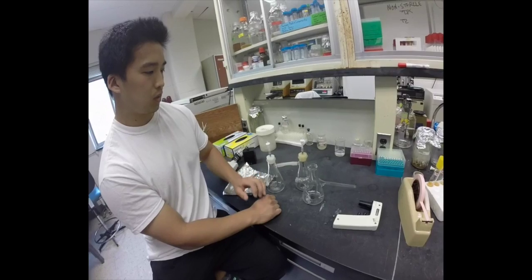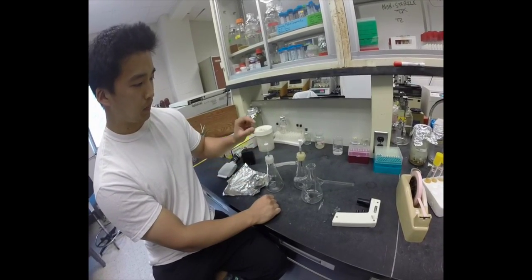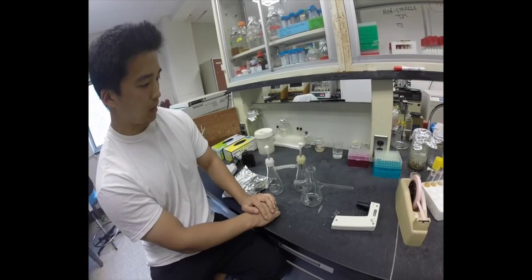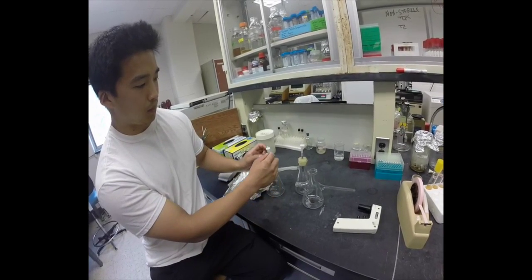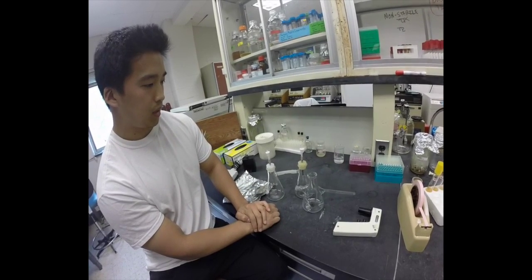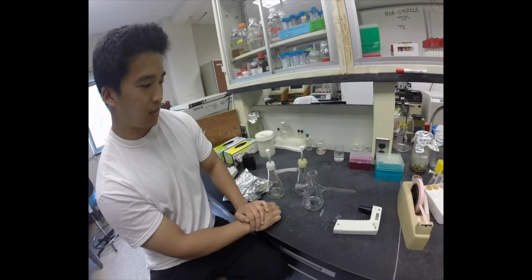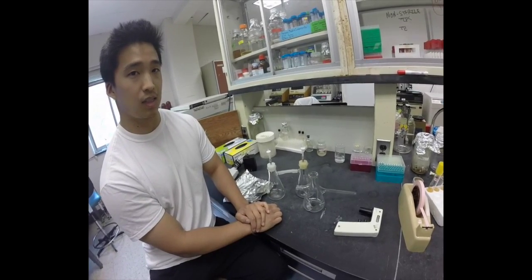If you want to do some gas composition analysis, you can put a 3-way fitting here and put a septum or a sampling port onto this assembly as well. So we can autoclave this, and then the next step will be the inoculation.